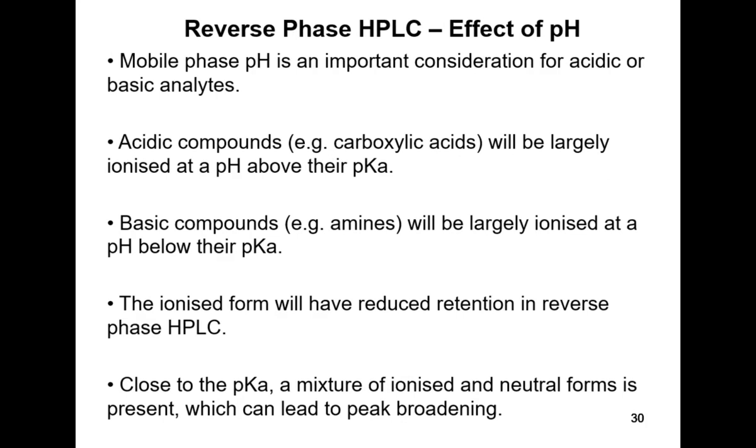Okay, so because the mobile phase now has water as a major component, we have to consider the pH of that mobile phase now. So pH doesn't mean anything with normal phase, because you're talking about organic solvents where there isn't this dissociation occurring of the solvent molecules in the same way, and you don't have the protons moving around within the solvent like you do in water. But with water we have to think about pH.